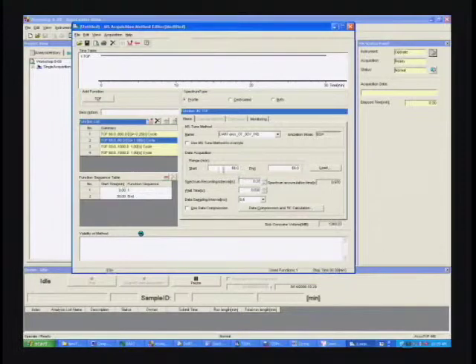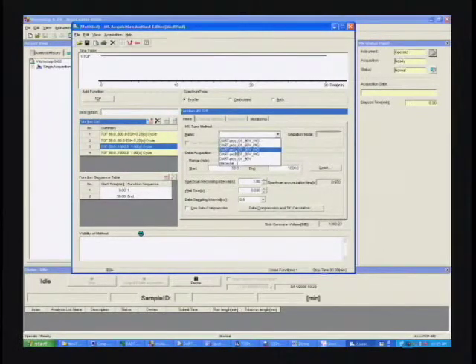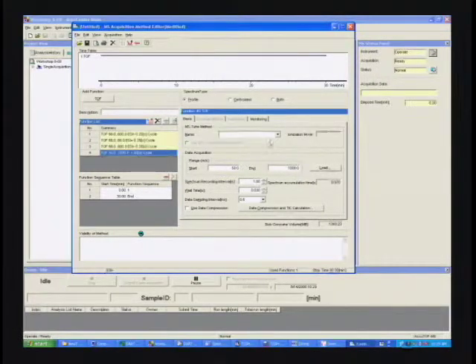And here, set each of these parameters. Number 3, we'll choose the 60 volt. And once again, we want each of these functions to be the same except for their orifice voltage. And the last one will be the 90 volt here. 66 and 600, and our recording interval at 0.25.